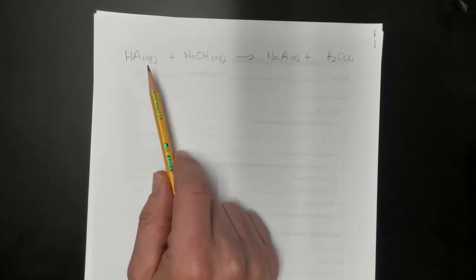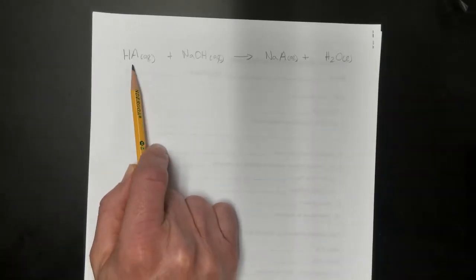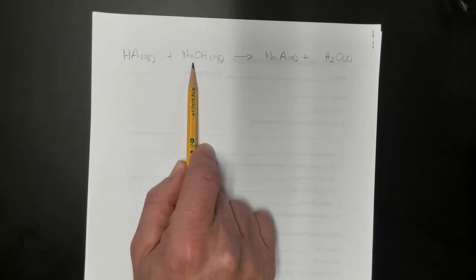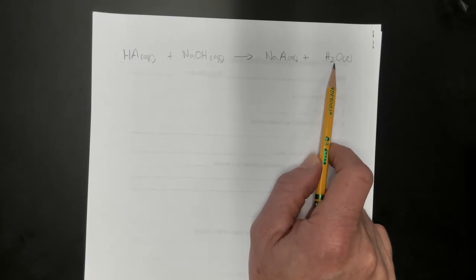The second acid we're going to be dealing with in this experiment is acetic acid. Right? So solutions of acetic acid are known as vinegar. Right. So this is the general reaction right here, and this chemical equation is balanced. Right. So in both cases, 1 mole of the acid will react with 1 mole of sodium hydroxide to produce 1 mole of the sodium salt, the conjugate base of this acid, and 1 mole of H2O. Right, that's the ratio. The ratio is 1 to 1 to 1 to 1.